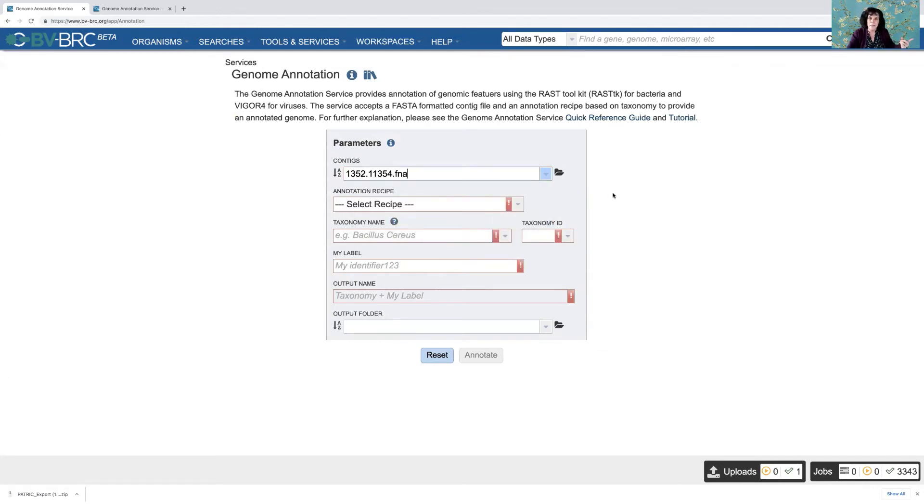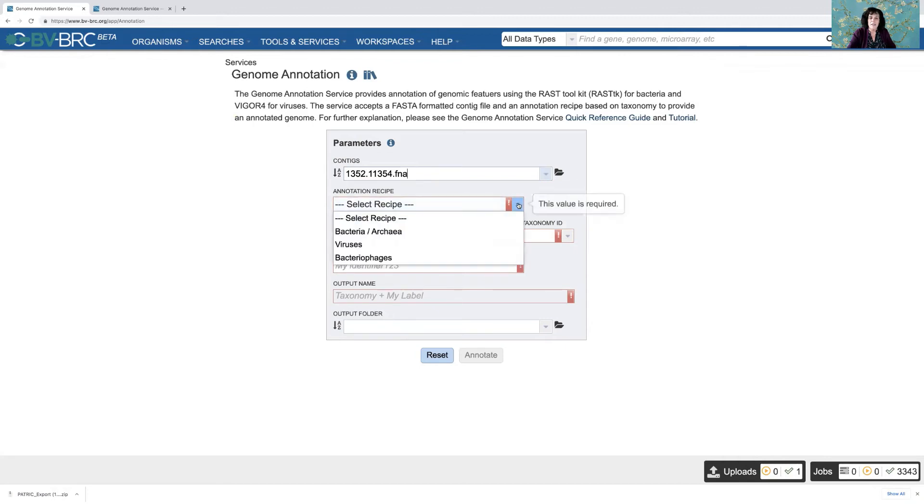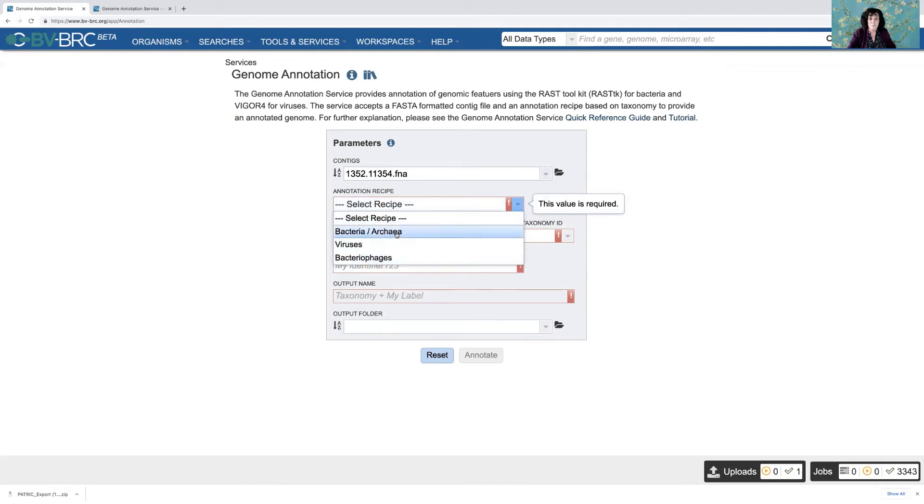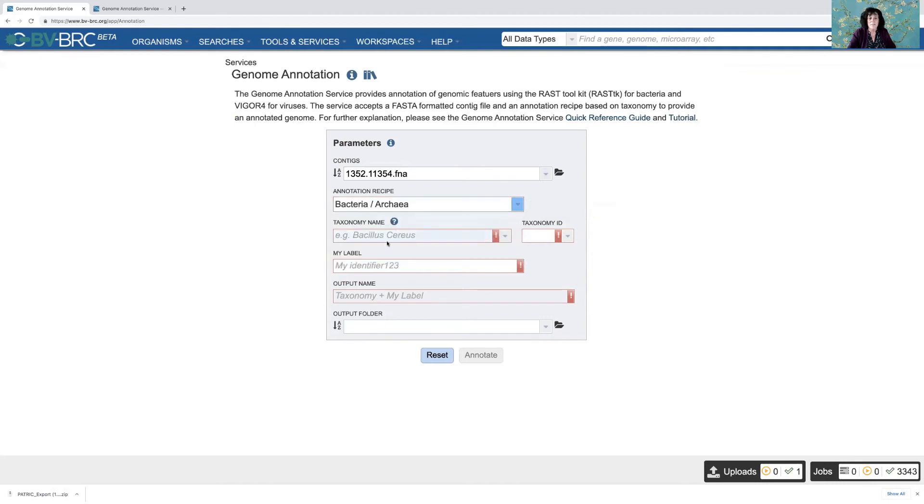First task completed, I've selected the data. Second task, set the parameters. The first is to choose an annotation recipe. So if I click this down arrow, I can choose either bacteria, archaea, viruses, or bacteriophages. But these are bacterial contigs, so I'm choosing that.